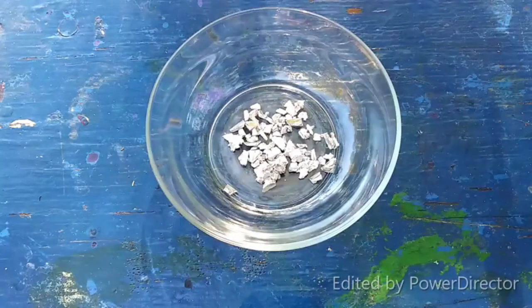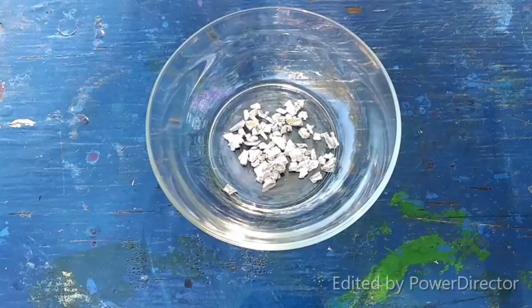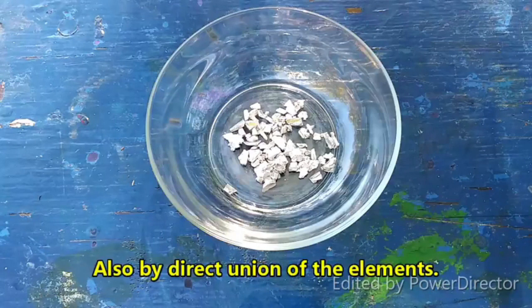Hello everyone and welcome to the Poor Man's Chemist. In this video I am going to be attempting the synthesis of indium monoiodide from indium triiodide and indium metal in refluxing xylene.